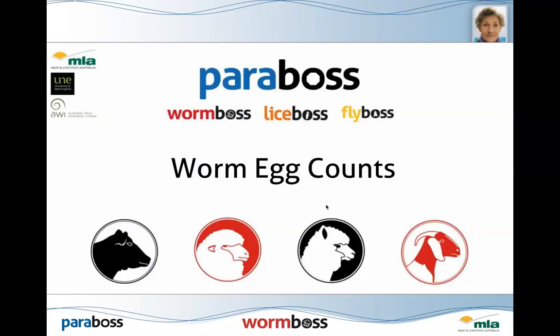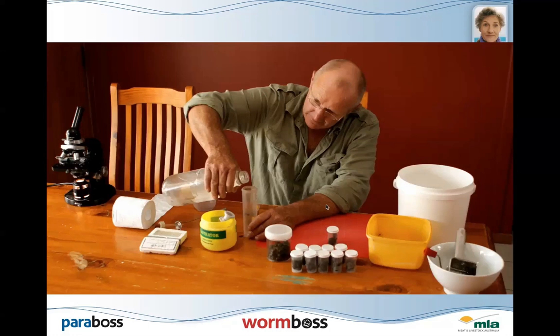Now I'm just going to show you here an egg count that's being done at home. It's just handy for you to know what's involved. We're not going to teach you how to do an egg count in this webinar, but if you've got some idea what's involved, it's pretty handy. Now, this animation shows Murray. He was the one collecting the eggs, the fecal samples from the paddock before.